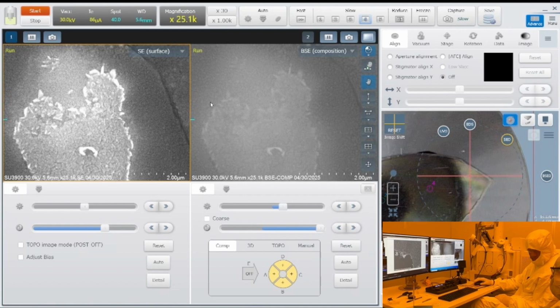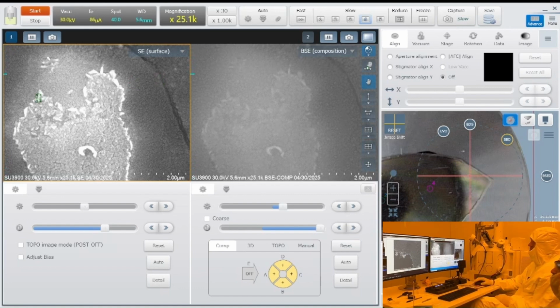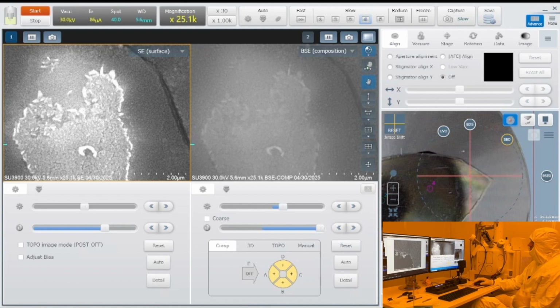Okay, so you can see the gratings are more visible here. Maybe you can take a look at this sample. Do you see, Zach, that's the grains, silver grains. That's what we are looking for. We want to see how these silver grains differ when the silver is deposited over different surfaces. Because we need to maximize the grain size.